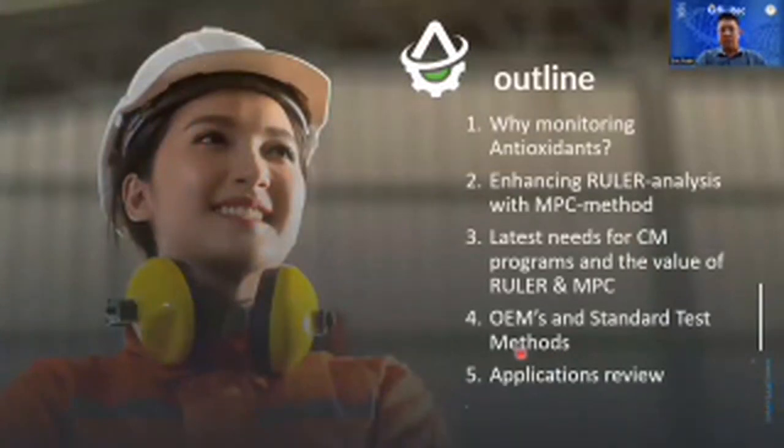The outline for today will include why and how to monitor antioxidants in lubricants. Secondly, I will show you how the integration of RULER and MPC testing will enhance your oil condition monitoring program. Then the latest needs for the condition monitoring program, and also the interpretation of the RULER value and the MPC result. I will show you the OEM recommendation and the standard test methods. And last but not least, I will also share some application reviews.